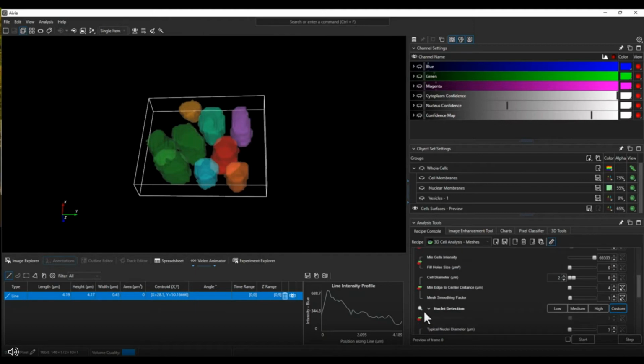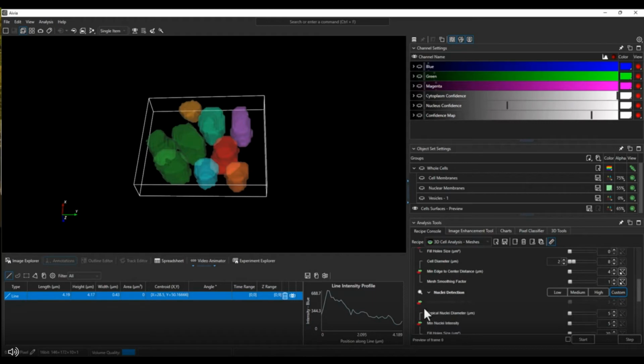And moving on to the next item, I'm going to actually detect nucleus in a similar way. You'll see these options all have different sliders that you could adjust. Cell diameter, using the same method I just showed you with the annotation tool to get a size estimation, then enter as you need. We recommend for the Cellpose algorithm that you turn off all smoothing and background subtraction to start with and add on these options as you go.